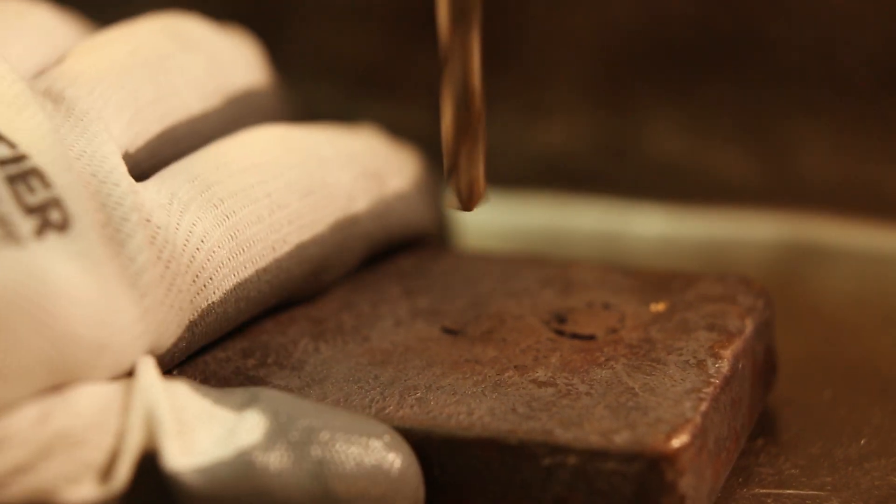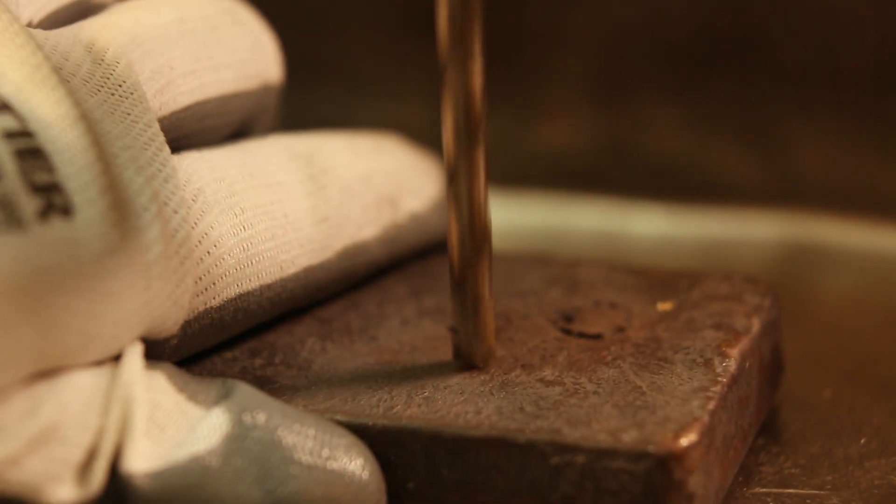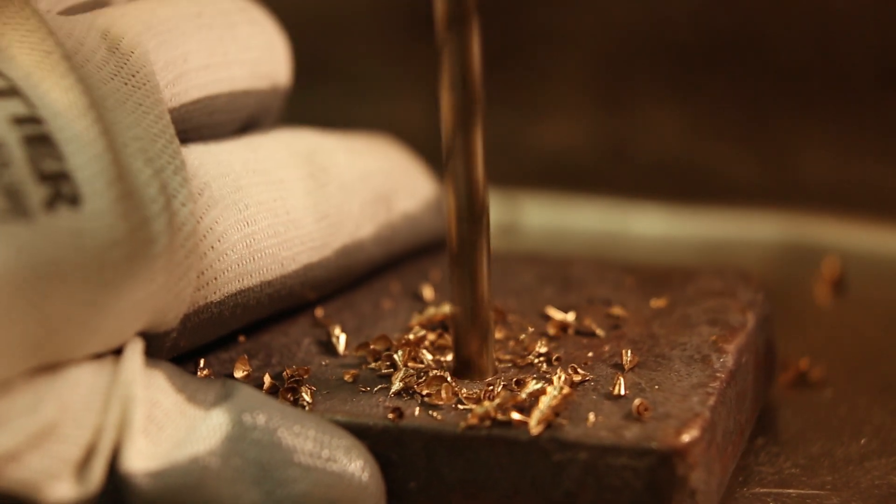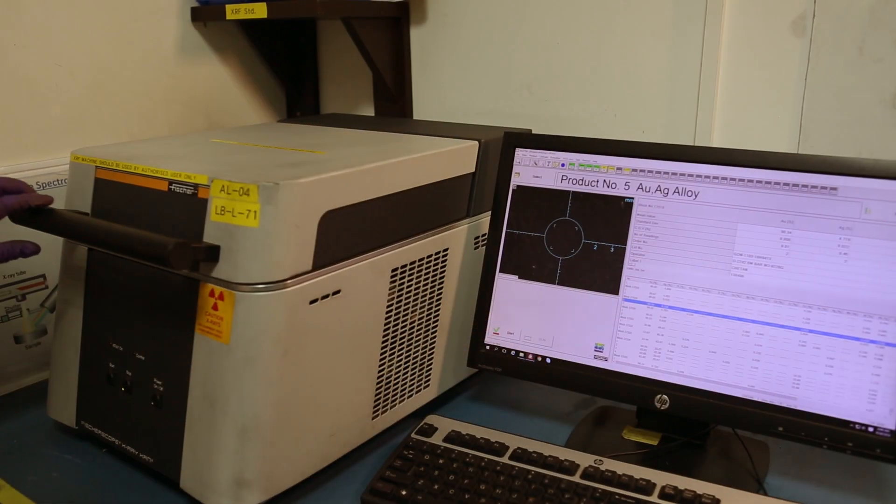A very small amount is drilled off from unrefined gold. It's called dory or scrap and becomes the sample for assaying.